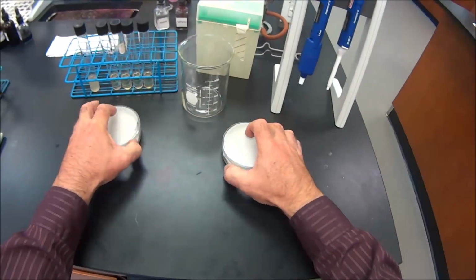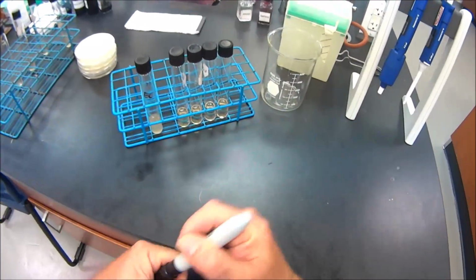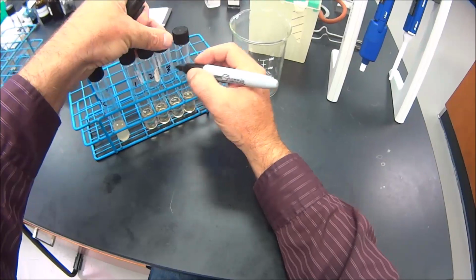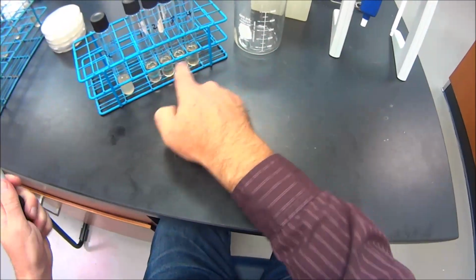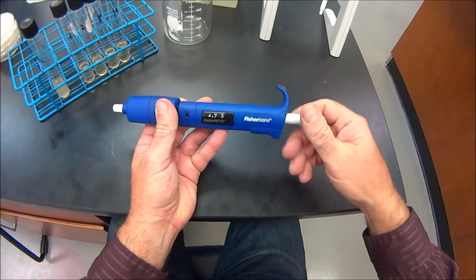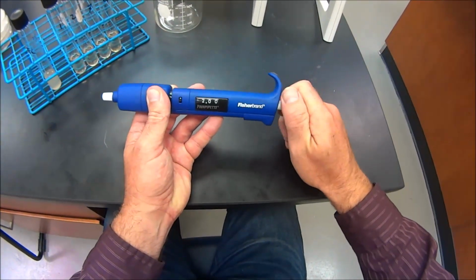Okay, here are 4 petri plates, but before we do that, here's our E. coli. Here's our tube 1, 2, 3, 4. Notice that there's 9 milliliters in all of them. We're going to turn this pipette back to 1.00. Showed you how to do that in another lab.